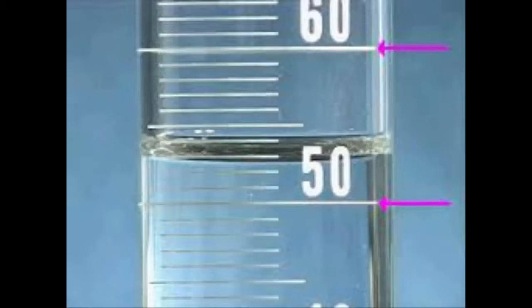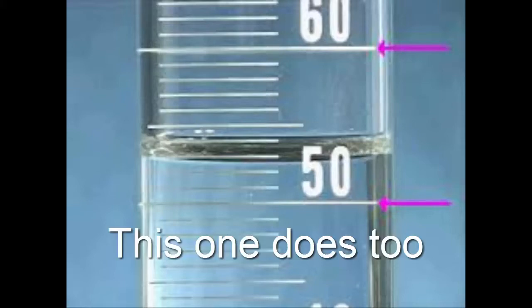Remember, there are different sizes to graduated cylinders, so the increments will be different. The one we will be using now can hold 100 milliliters and goes up by increments of 1 milliliter.